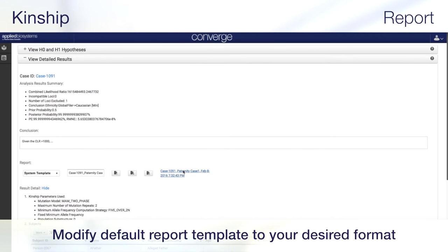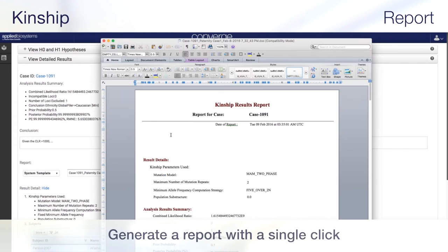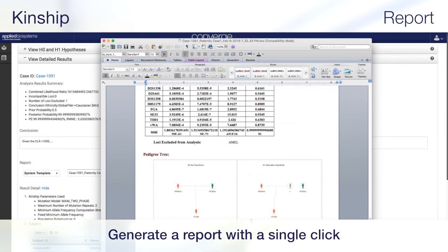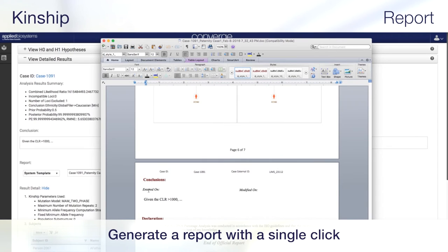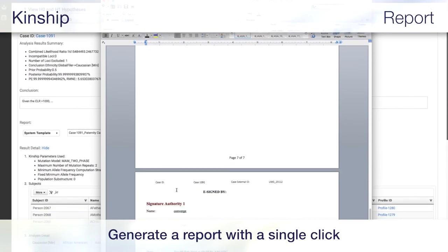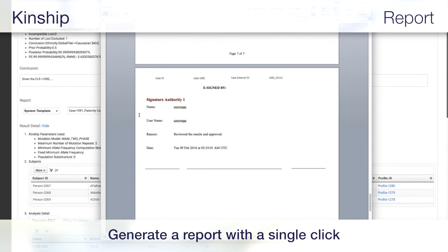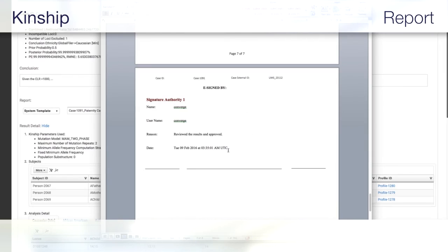With Converge, you can use existing tools to modify the default report template and adjust it to your desired format. With a single click, a report is generated and you can review all the details in the report, from analysis parameters used to generate the report to analysis results, pedigree trees, conclusion statement, as well as e-signatures.